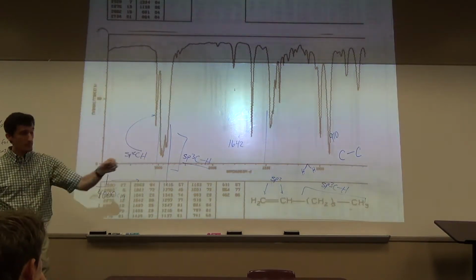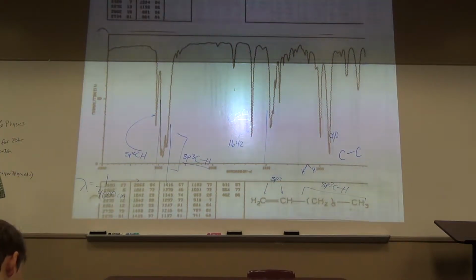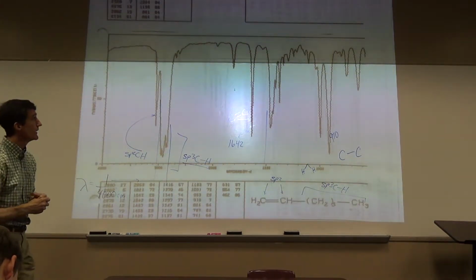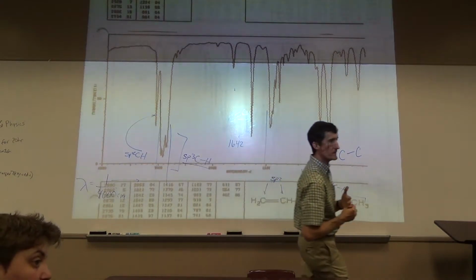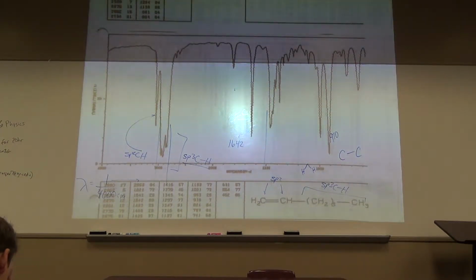So some bonds absorbed the energy that was thrown at me, but some of the bonds also absorb the double amount. That's an overtone. I think it's also called a second harmonic. You know some physics? Maybe in guitar strings or something, there are other places where that's seen, but I don't really know. I think it's an overtone. We'll see other overtones along the way.